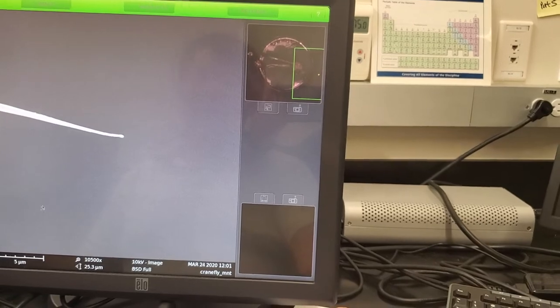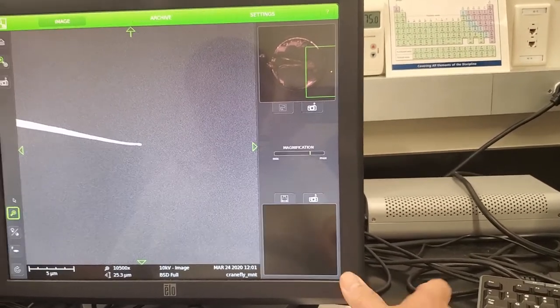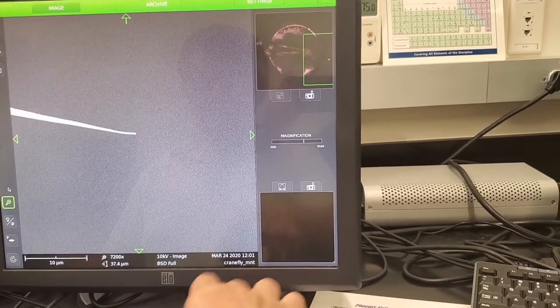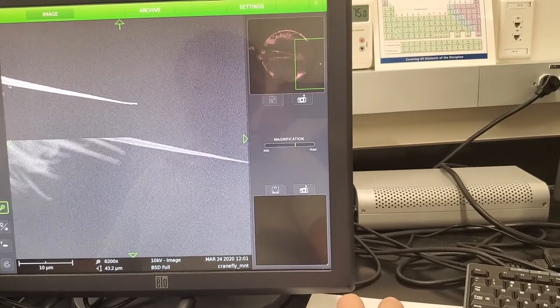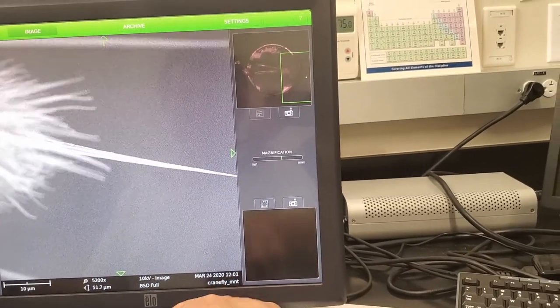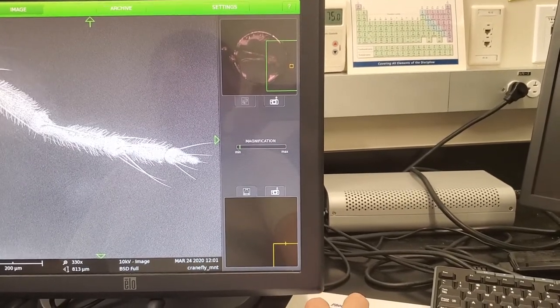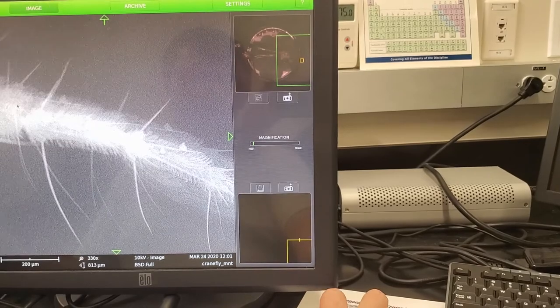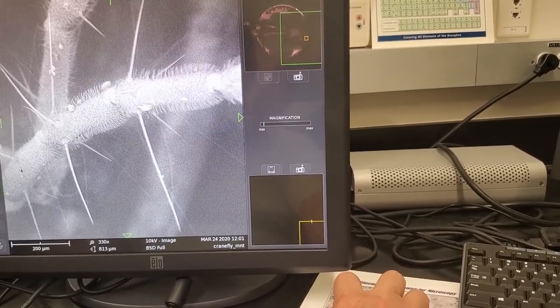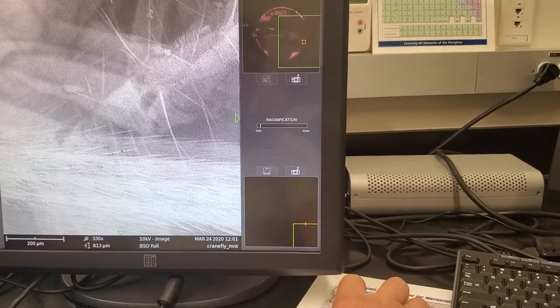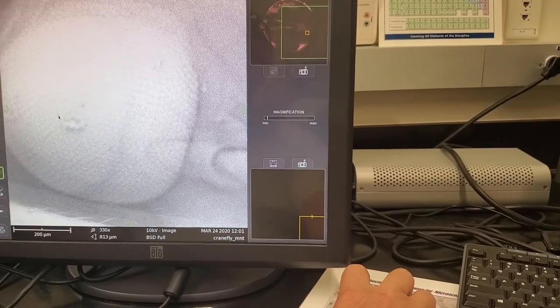I asked it to demagnify — it did a hiccup. Anyway, I think this is about good for now. I'm hoping that they'll be able to get us back in and I'm going to let you guys play with this thing again. Say goodbye to the crane fly.